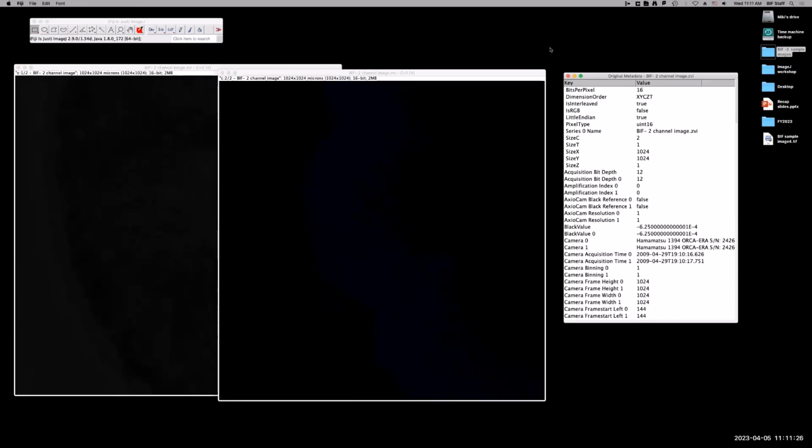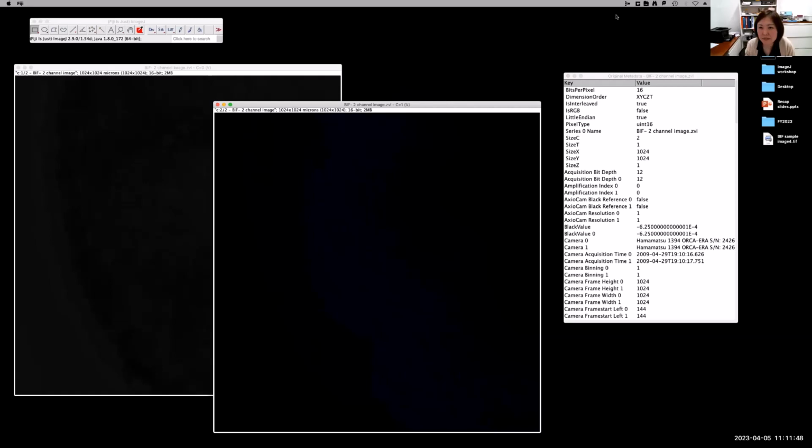So yeah, several people has a trouble. Oh. Yeah, you can try plug-in bioformats importer if it doesn't open.